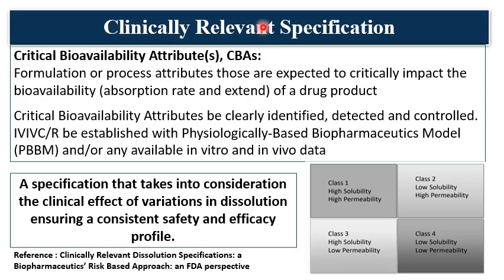Then coming to the clinically relevant specification. Till now we have talked about the discriminatory dissolution method and discriminatory dissolution specification, but now it is the clinically relevant specification, and nowadays the regulatory authorities are going towards the clinically relevant specification. Why? Because for formulations which are given orally, the dissolution reflects into the clinical action. That's why these clinically relevant specifications are required.